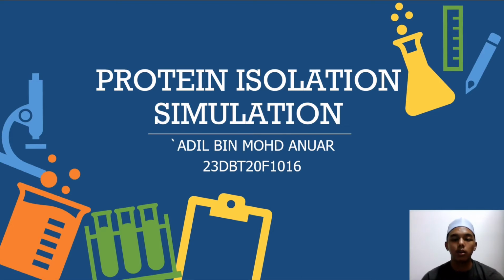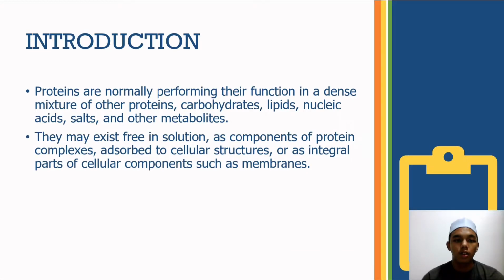23DBT20F1016. So now I'm going to talk about our lab assessment, that is protein isolation simulation. So a little bit of introduction about protein.